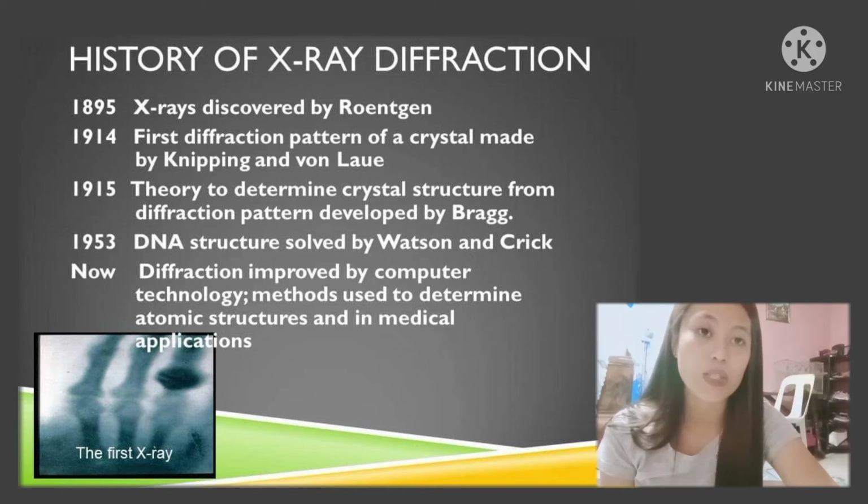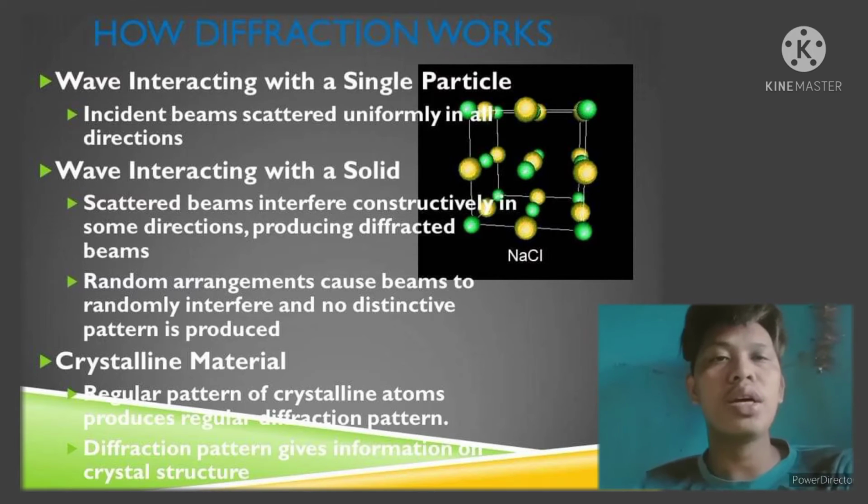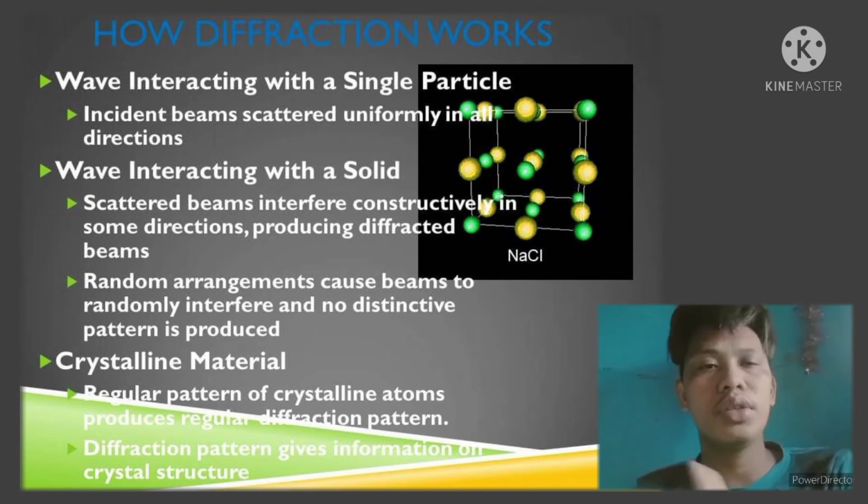And lastly, in today's generation, diffraction has been improved by computer technology and methods used to determine atomic structure and in medical applications. Today, we are going to tackle how X-ray diffraction works.